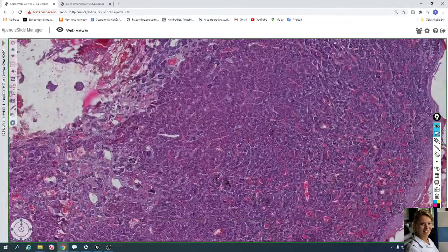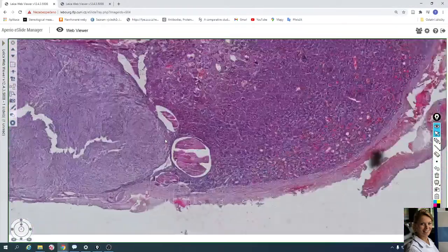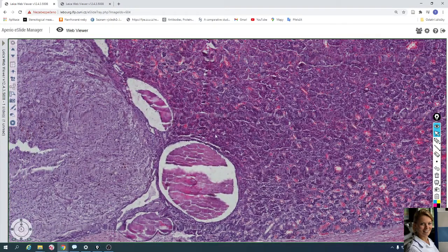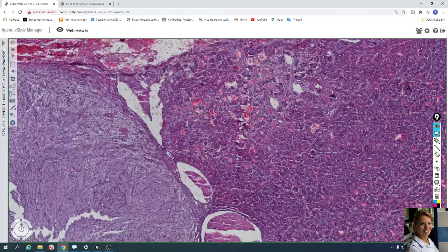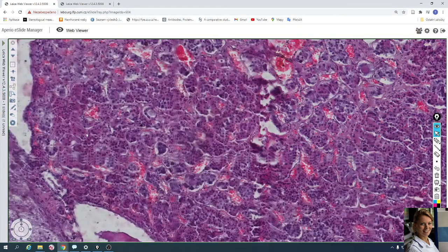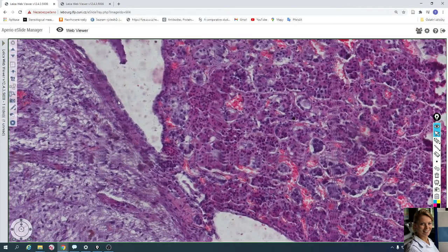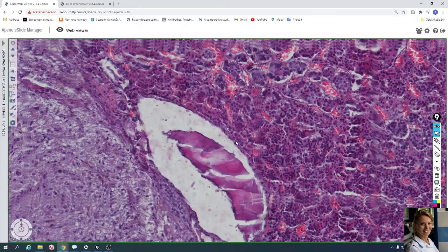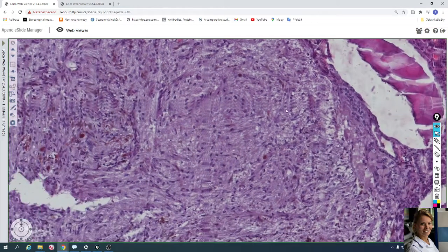Here is a follicle with colloid — a Rathke's follicle, here and here — which is lined by a single simple layer of cuboidal cells. You can see the single layer of cuboidal cells and colloid in the lumen of the follicles.